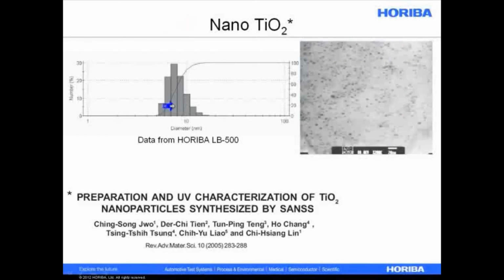What you see here, the median size would probably really be talking about maybe Z average, but it's down under 10 nanometers. So if your samples are all down to 10 nanometers and lower, then you're not going to be using laser diffraction, ours or anyone else's. You're probably going to be using dynamic light scattering. For the smallest size distributions you see in the world of pigments, that's when we switch to dynamic light scattering. This was from an older model.